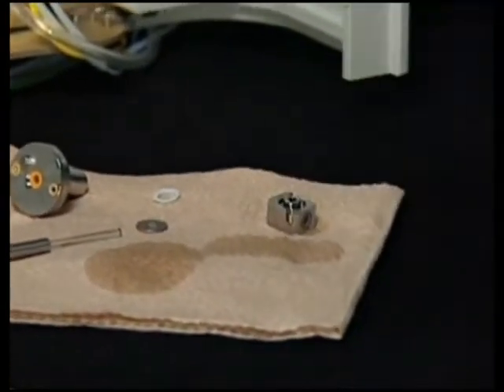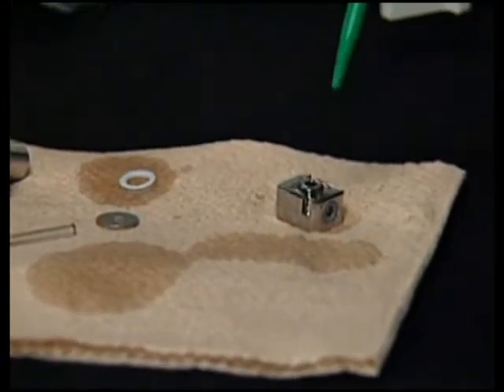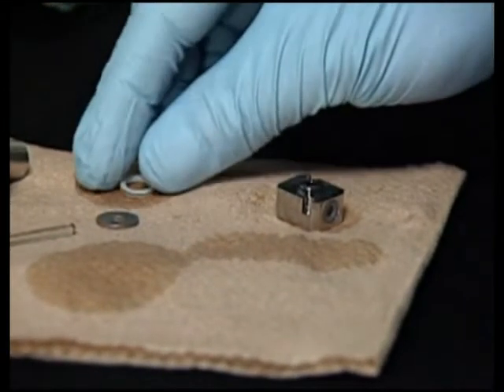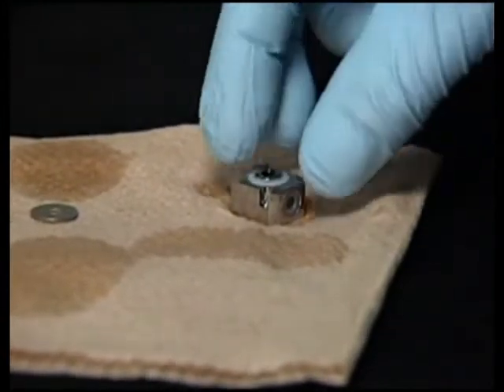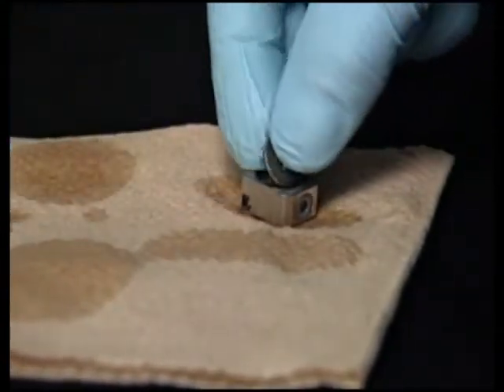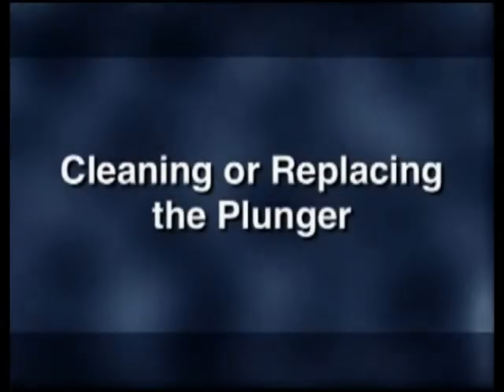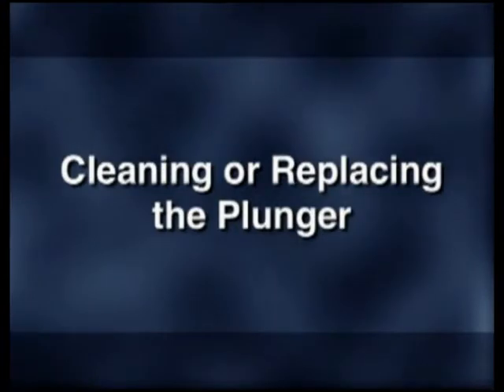Thoroughly wet the new face seal and the front side of the seal wash housing with methanol. Install the new face seal into the housing. Replace the flat washer on top of the plunger wash seal. Replace the flat washer on top of the seal wash seal.